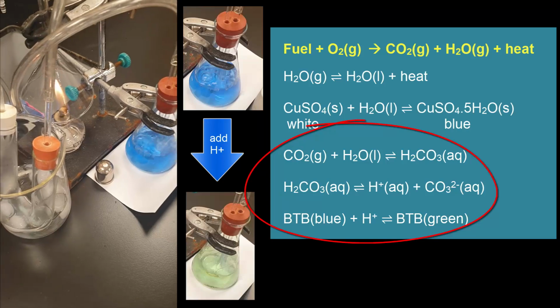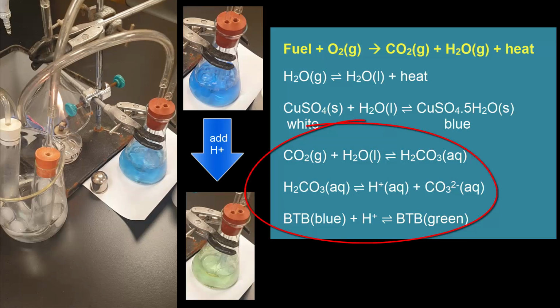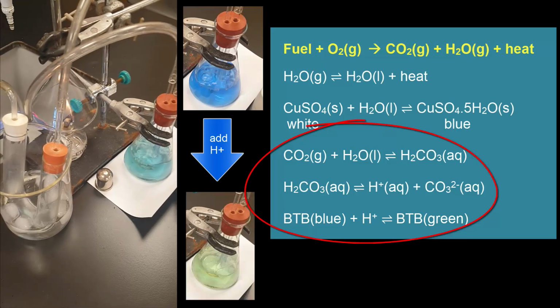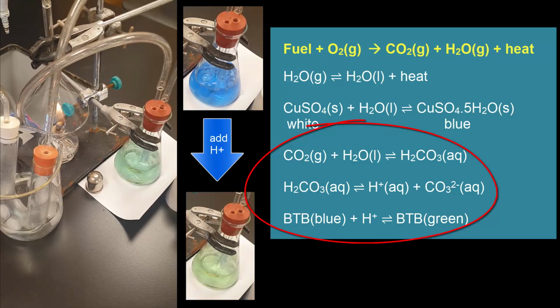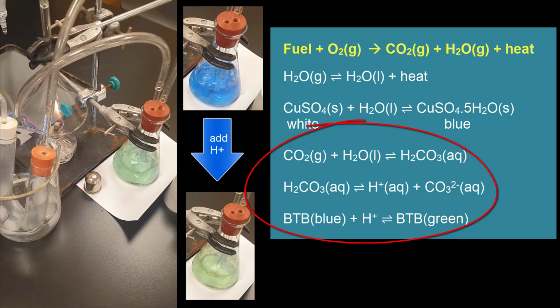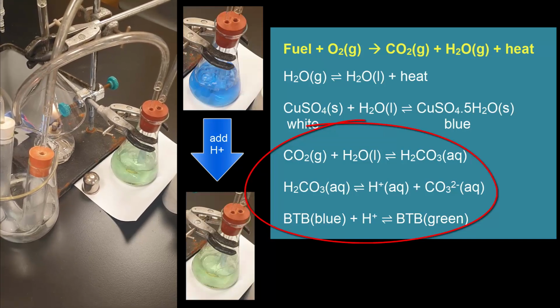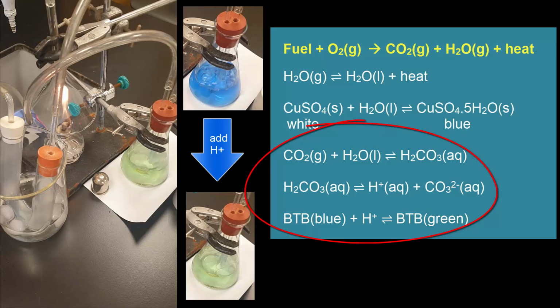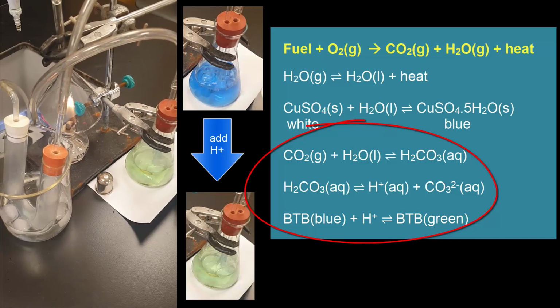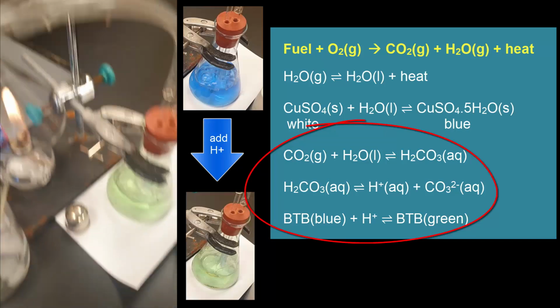You can see that I think it was ethanol that we actually end up burning. The ethanol's burning there, and then it's first going through that U-tube, condensing, cooling to see the liquid, and you probably just missed it. It then bubbles through that conical flask, and now it's green already. You can just rewind it back and see that it was blue. That's getting bubbled through because at the very end there's a pump that's pulling the air through, and you can see it also melts at the top there.